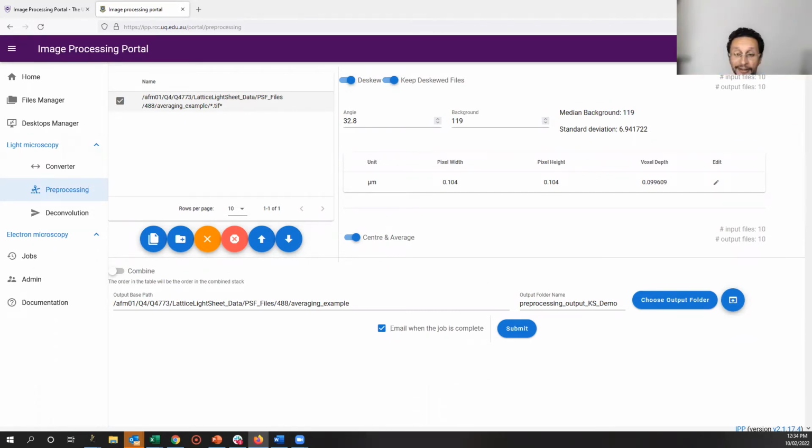Yeah, if it's okay. My name's Roland, I'm from WEHI, and I've had some chats with Niall over at WEHI around this. One of the things that he mentioned to me, I just wanted to see if it was similar in your workflows as well, is that when you're doing the actual capturing of the videos on the instrument, it'd be great to know as early as possible whether those videos are worthwhile keeping or not.